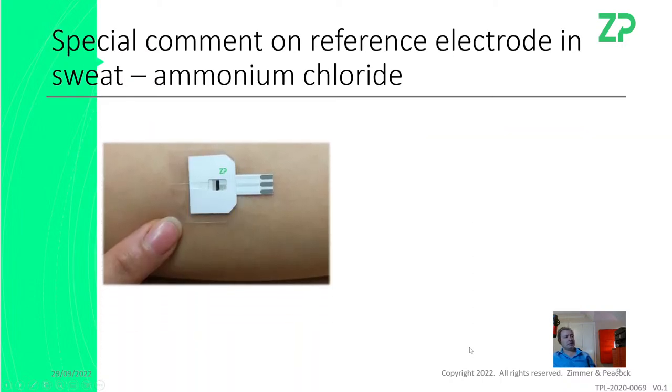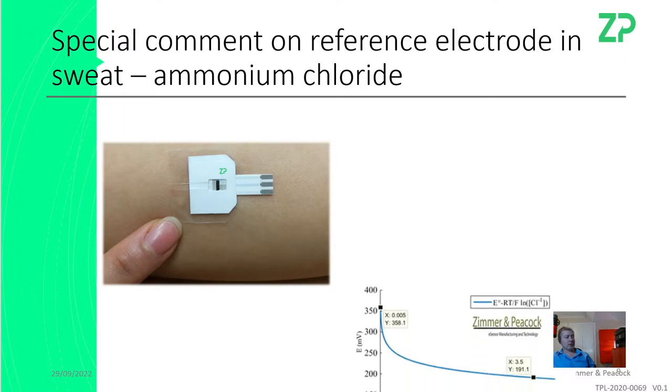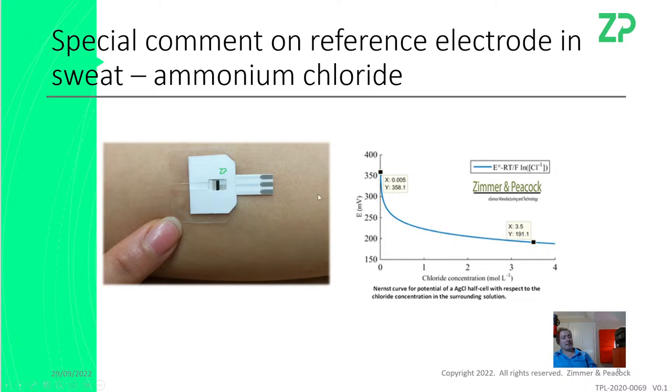This is just something I wanted to touch upon as well. When you're doing sweat analysis, especially with ion selective electrodes, this is probably worth coming to one of our workshops about, to be honest with you, because the chloride reference electrode is chloride sensitive. Now, most of the time, chloride in biological solutions is at about 150 millimolar. If it was to change significantly, which I doubt, you're not going to go to one molar, but you can see that the reference electrode shifts. And that's why sweat is, in particular, quite a tricky analyte.